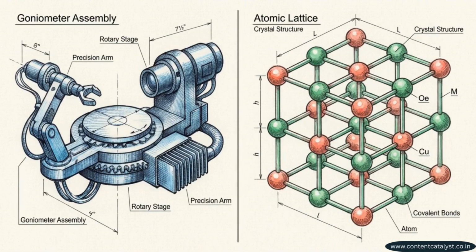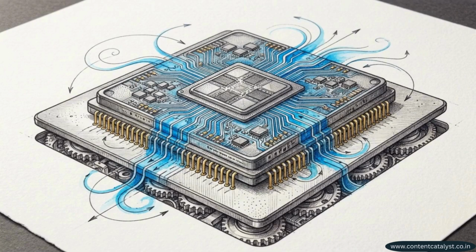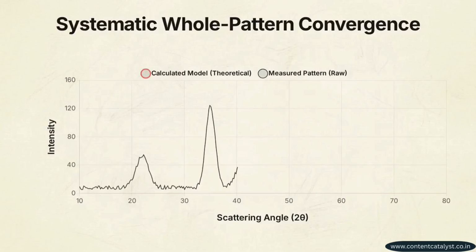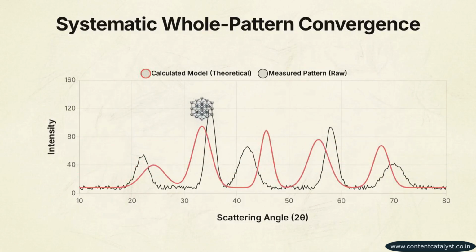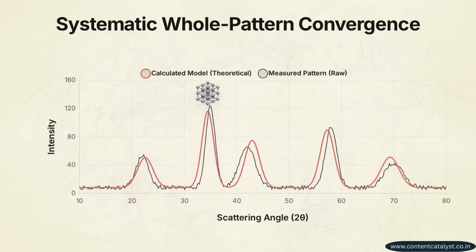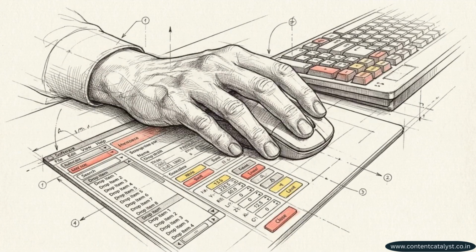That separation is the primary function of Profex 5.7.1, an open-source analytical environment built specifically for this kind of high-level diffraction analysis. At the core of the software is the BGMN kernel, a mathematical engine dedicated to Rietveld refinement. Instead of looking at individual peaks in isolation, Rietveld refinement treats the entire pattern as a single system. It takes a calculated, theoretical diffraction pattern based on known crystal models, and iteratively adjusts its parameters until it matches your physical measurement. Profex does not attempt to automate scientific judgment.